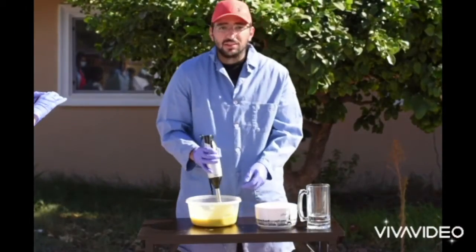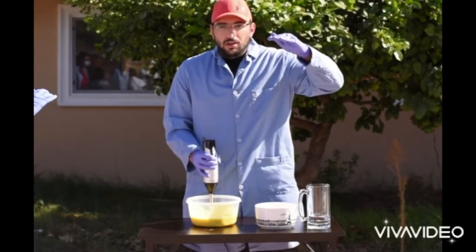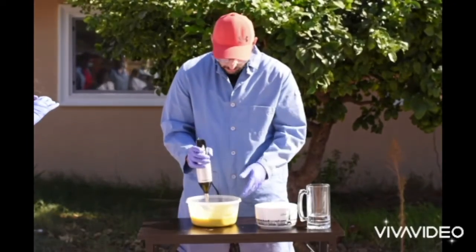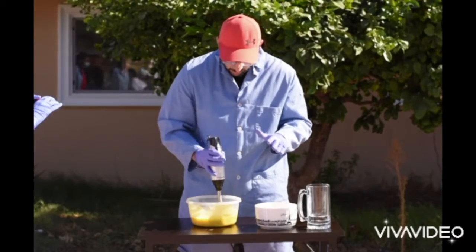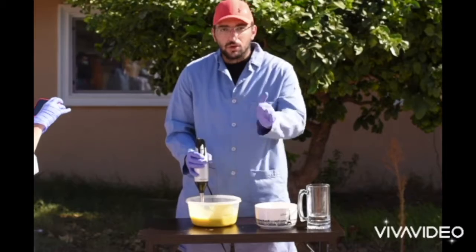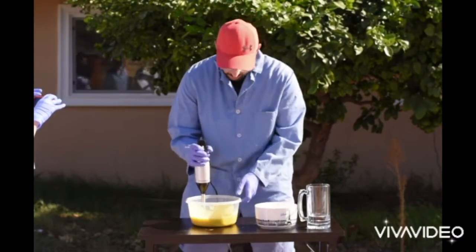And by the way, we keep mixing it to ensure that all the sodium hydroxide has been reacted, right? So that's how you can turn it into soap. If you still see it not homogeneous, meaning there's still some trace water or sodium hydroxide left, you have to keep mixing so that it's all thoroughly mixed.